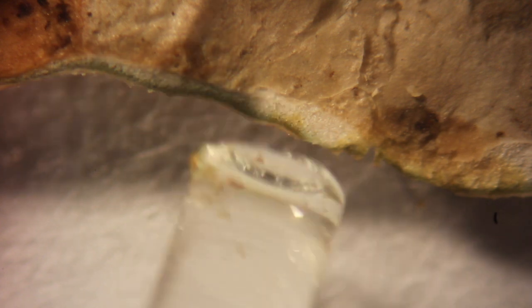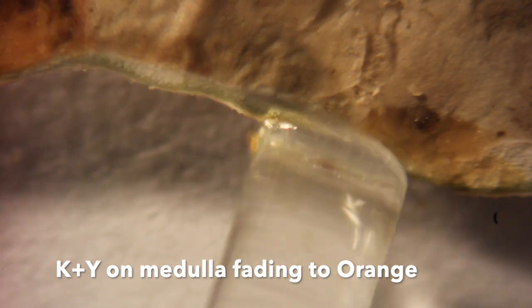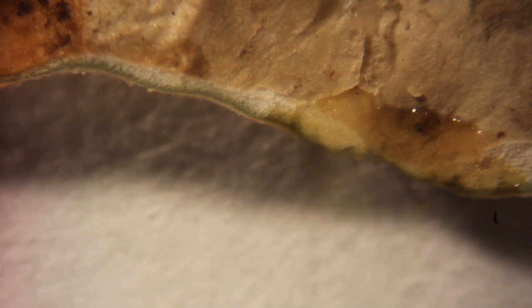The last example of a K reaction is the K plus Y fading to orange. Here you see the medulla quickly turning yellow, but after a few seconds it darkens into orange. If it's not obvious right away, try rewatching the reaction at a faster speed.